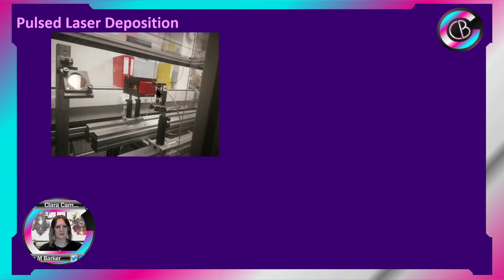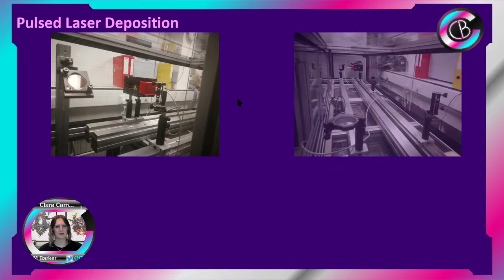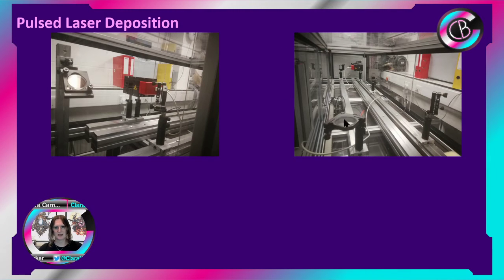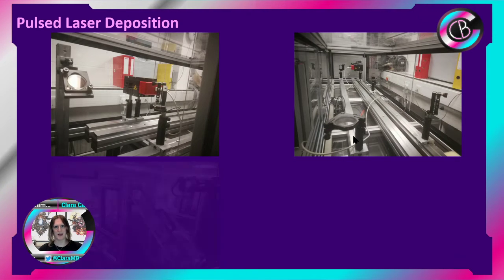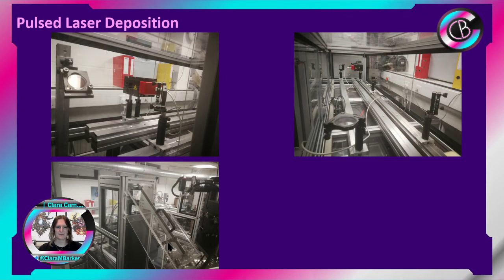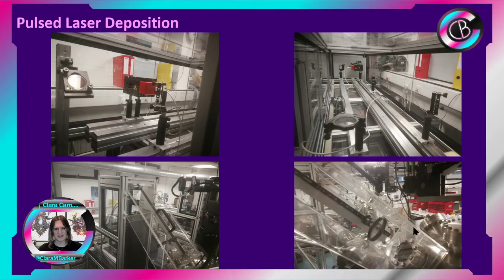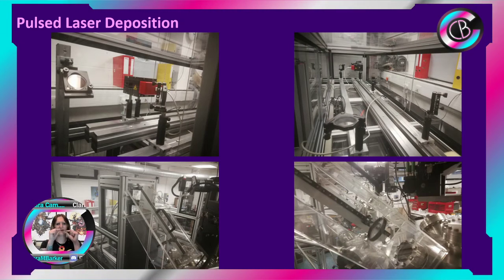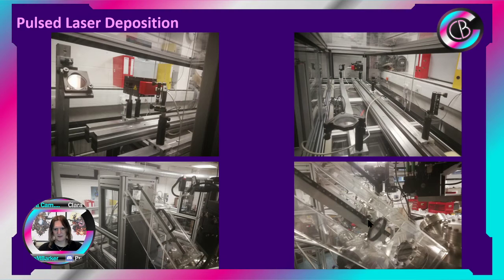This is an attenuator so that we can just change the angle a little bit, and it travels along through this big massive space where it bounces off another mirror, and then it bounces off another mirror, and then it heads back up the run, and it bounces off another mirror, and then it bounces off more mirrors, until eventually we focus it. So we bounce it down through a magnifying lens, and this focuses it to a very, very fine point, and it enters our chamber.